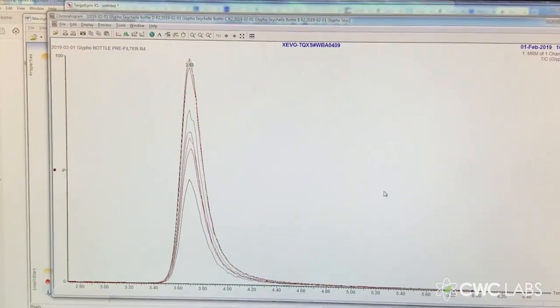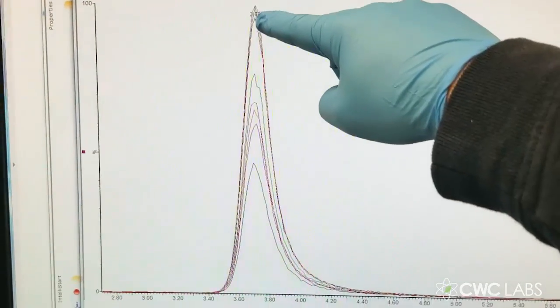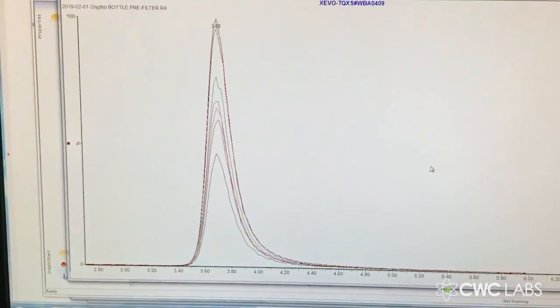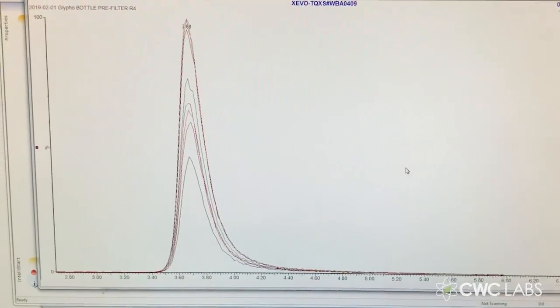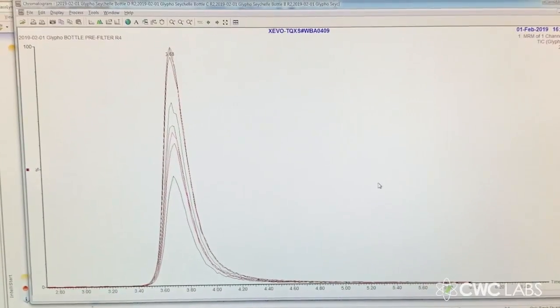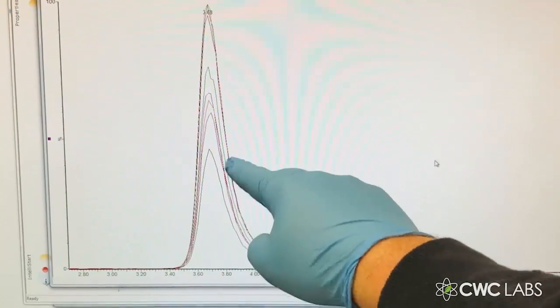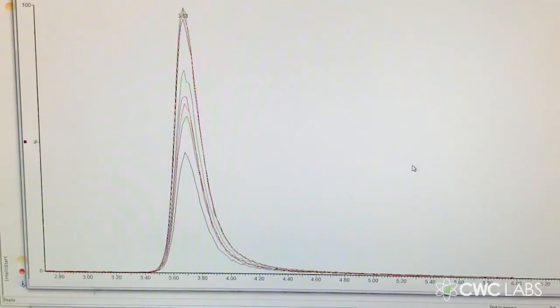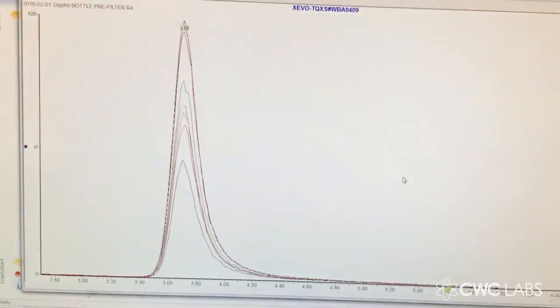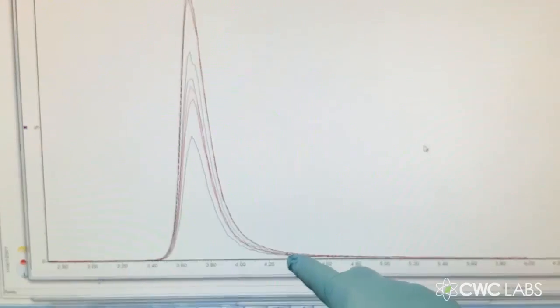All right, these are the bottle water filter test results. Now, this cluster that you see up here, those 3, those are all the non-filtered water. That's the 2 ppm glyphosate. I ran it 3 times just to make sure we're getting consistent results, and we are. But what's really interesting is these are the water bottles showing the resulting glyphosate concentrations at different levels below the original 2 ppm.